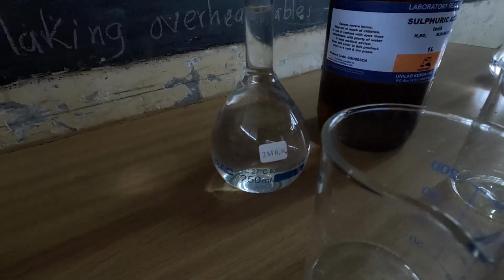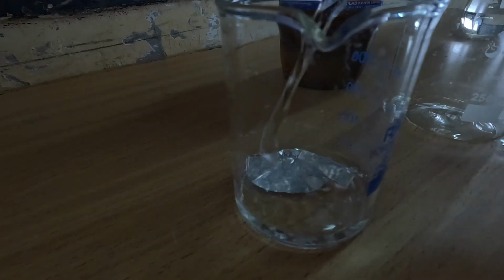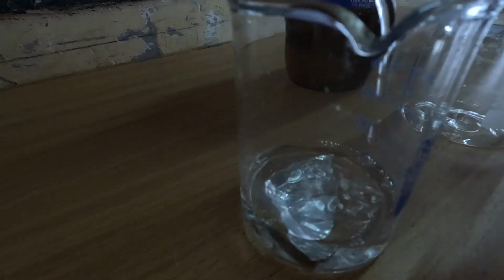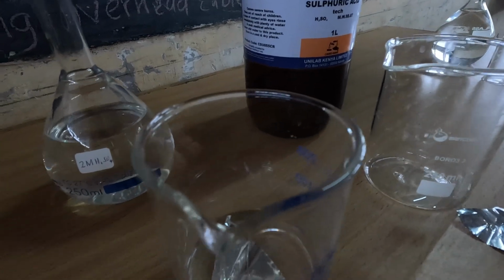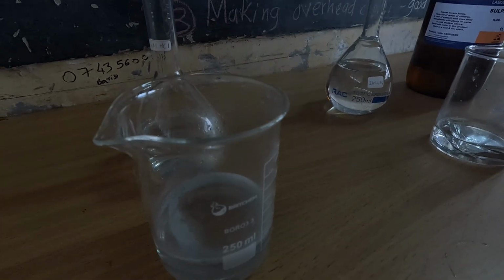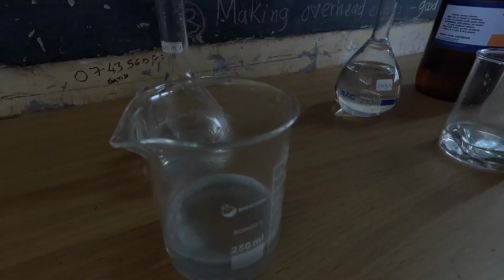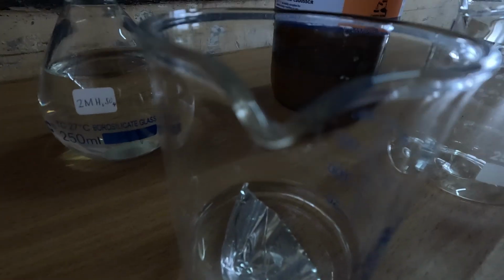Our second reaction is reacting it with dilute sulfuric acid. So again, we place our aluminium foil inside the beaker and add sulfuric acid. So what you can see, there is no reaction, no apparent reaction. Getting back to the one for HCl, it is still reacting and even more vigorously as hydrogen gas is being liberated, and also at the end of the day we're going to have aluminium chloride being formed. For the one of sulfuric, no reaction.